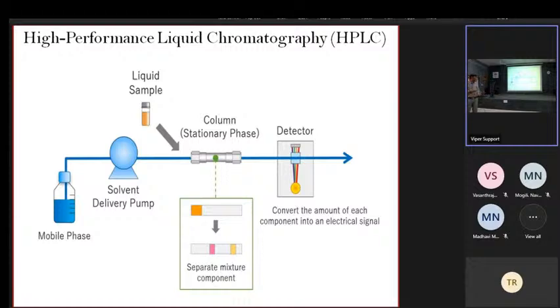Okay, so now we are injecting somewhere here. The molecules are made available to the column. The column length is up to 30 centimeters. These are short columns. Gas chromatography columns are in meters, while HPLC columns are in centimeters. So this is the column inlet and column outlet.